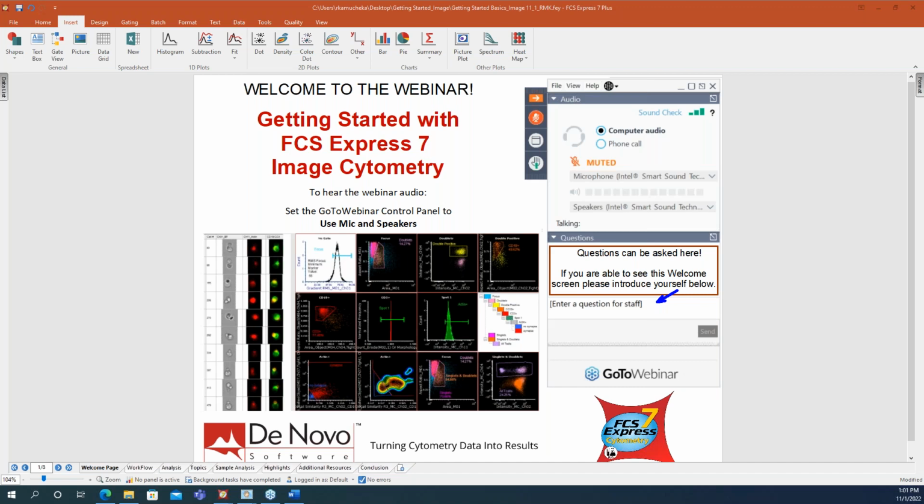So as you can see, FCS Express is not only a flow cytometry analysis software, but it can also provide the tools you need to analyze your image cytometry data. Today's webinar is a great start on exploring what FCS Express has to offer to you by introducing you to some of these tools, features and capabilities.